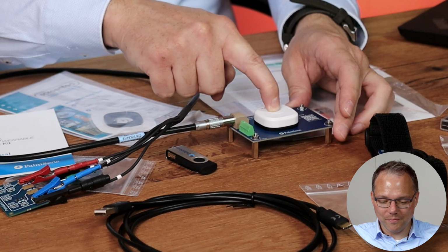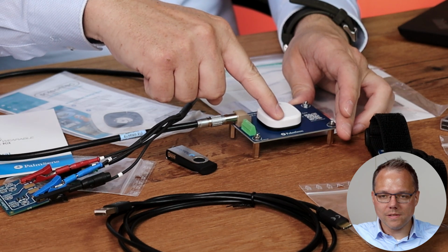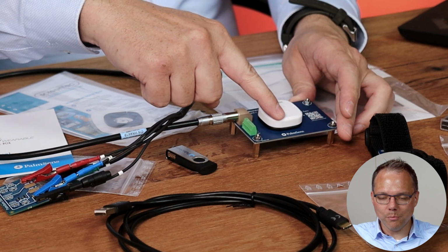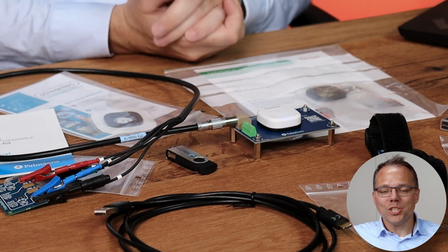Now, the last thing I need to do after I've set up my cell is actually switch on the Sensit Wearable. So I just press it, and then you see here a blinking blue light. It's slowly blinking, and that indicates it's ready to get connected and receive commands. Well, how do we send commands? I will connect via our software PSTrace and Bluetooth to the Sensit Wearable. So let's have a look.